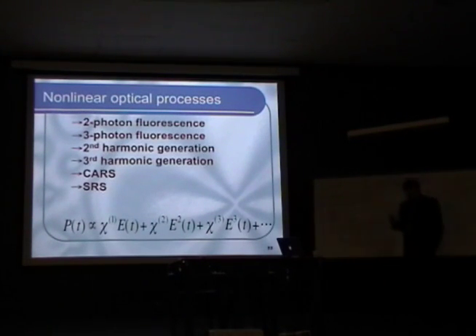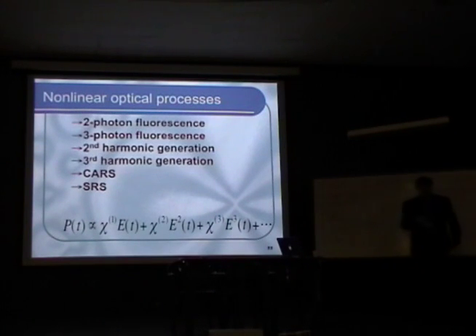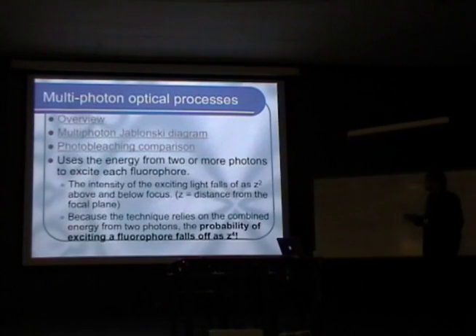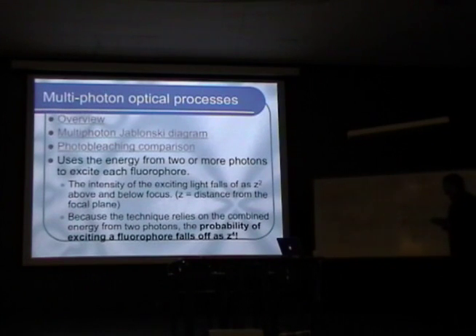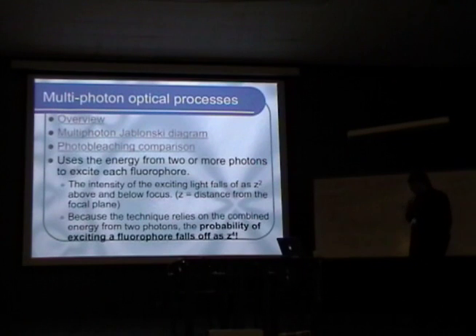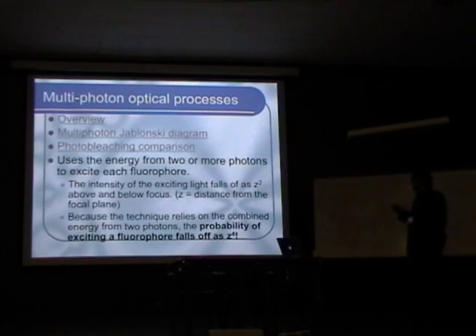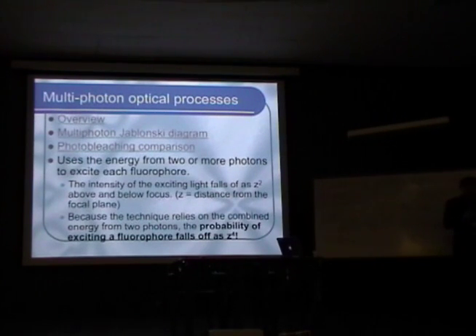I will now proceed with discussing the basic principles behind those nonlinear optical processes, and I'll show how they can give many benefits in terms of three-dimensional optical imaging of different samples of interest. Right? So in the remaining part of this lecture, I will give an overview of what those nonlinear optical processes are, but I would like to start from a basic motivation, why they are of interest, and what are the benefits that they can provide.